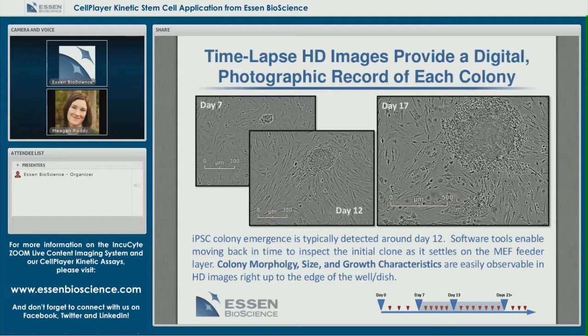During the middle events of reprogramming, this is the exciting time where you begin to watch pluripotent colonies emerge. With the whole well being imaged, you get HD quality images right up to the edge of the well. On day 7, the transitioning cells are lifted and reseeded onto either feeder cells or a feeder-free matrix material. The transitioning cells settle down and begin to evolve into colonies. Traditionally on the stereoscope, colonies might be identified around day 14 or 15. However, using IncuSite imaging I spent more time thoroughly inspecting the whole well, so colonies were identified earlier. Using the time tree, I could move back in time to see what a colony looked like at the time of reseeding and then move forward to watch that colony develop over time.